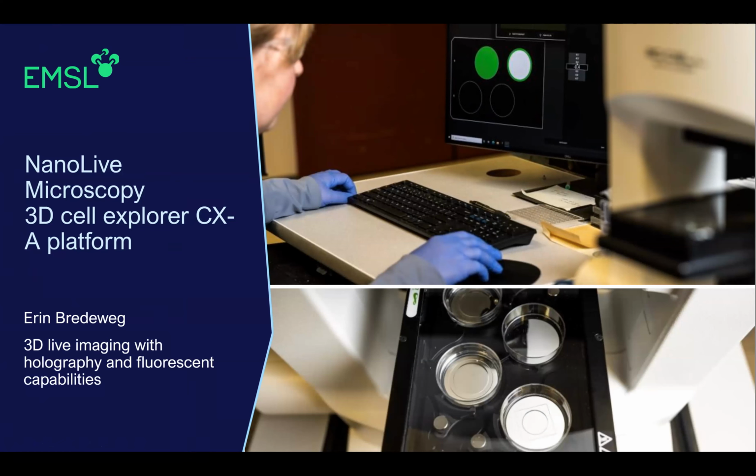But for now, let me talk through and present some cool data from the NanoLive. So I'm going to talk to you about a commercial platform that EMSL has on site called the NanoLive. They offer several different platforms. The one that we have is the 3D Cell Explorer CXA platform, and its specialty is holography, and it is also able to collect fluorescent data.